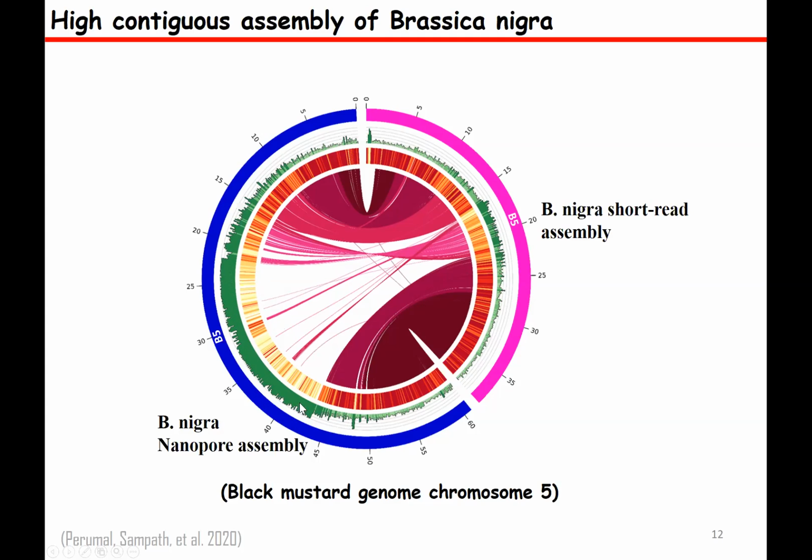The green shows the depth of repeats. When there are a lot of repeats in nature, it's really hard to assemble. And you know that plants are really complex. Even 90% of the genome is repetitive, especially for maize or wheat. And you need this technology to overcome those complexities and also the polyploid nature.